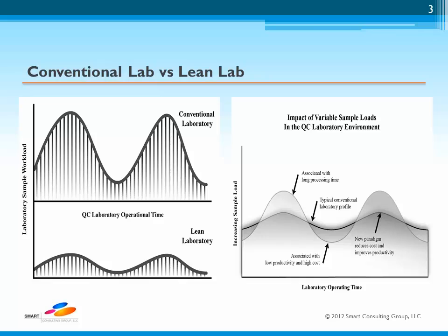process. For example, the process of data entry labeling might be very cumbersome using a combination of paper and electronic means to achieve the goal. They might also involve the analyst walking from a computer station to a centralized printer across a hallway, for example, to print out labels or worksheets. In all these cases, there's a variety of waste sources, and these include motion waste, unnecessary repetitive data entry, over or under production of labels, and possible defect waste as mistakes are made.